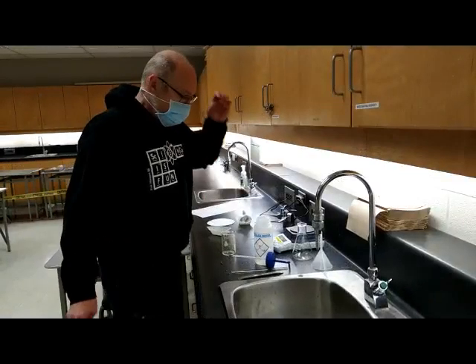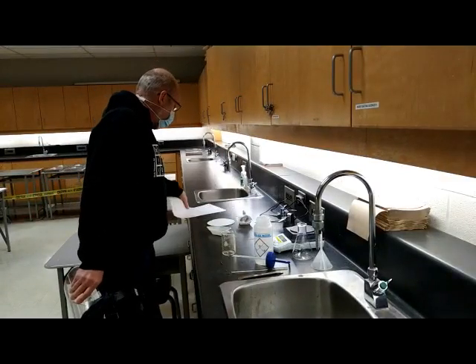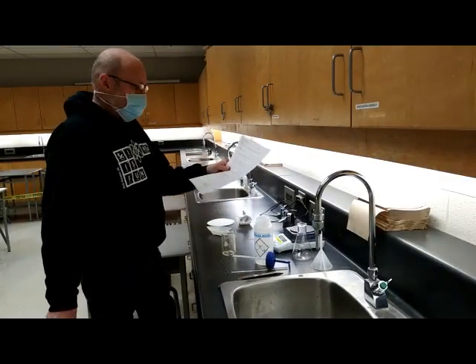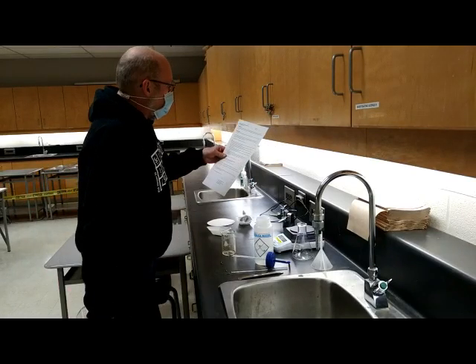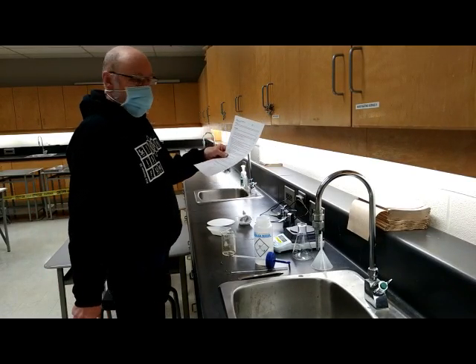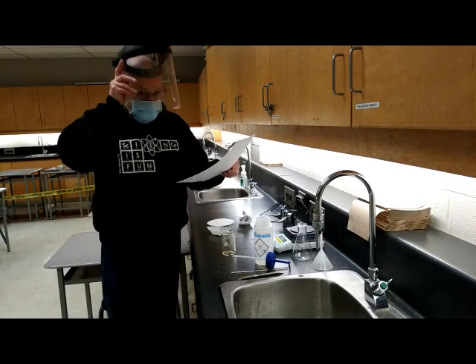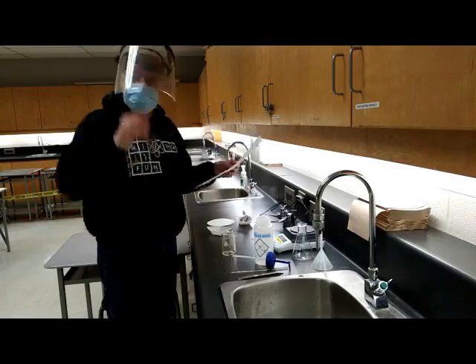We are now starting our lab. You have the copy of the paper, probably an electronic copy of this. And so we're going to follow the procedure here, just as if you were doing the lab. Of course, I'm going to put my PPE on. I need to see, so I'm using the full face shield today.